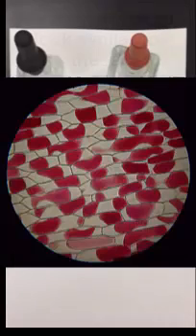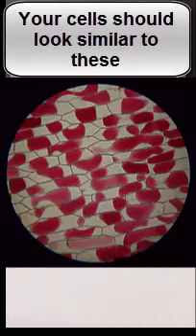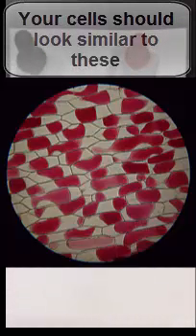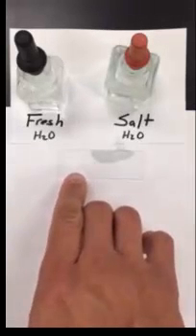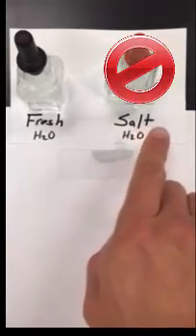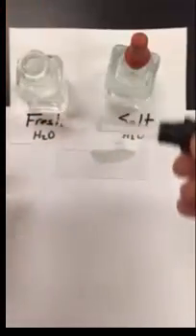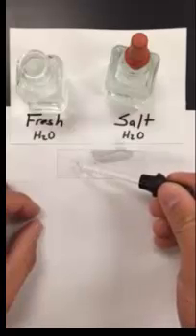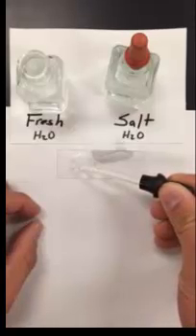So at this point you've set up your slide and you are ready to do numbers seven through ten. Now that you've finished number seven through ten we are now up to step twelve. Now step twelve is going to be very similar to step seven in that we're going to add water to the left of our cover slip again but we're not going to use the salt this time we're going to go back to the fresh water. So the fresh water we're going to take some samples of that, place it to the left of the cover slip and it's going to be the same exact procedure as we did before.